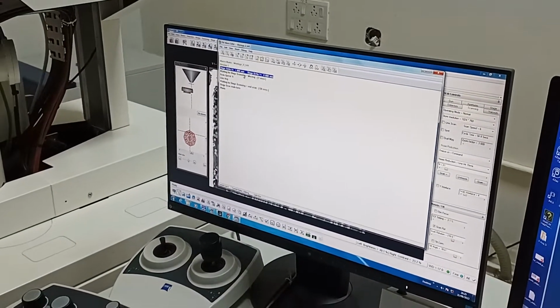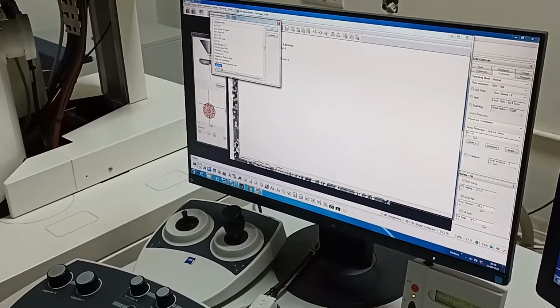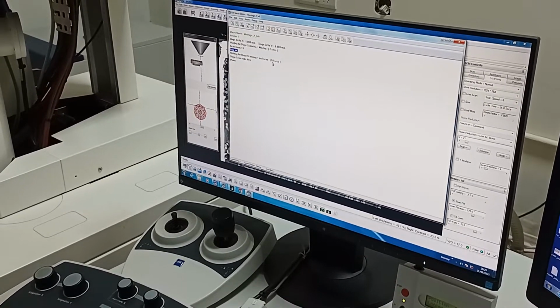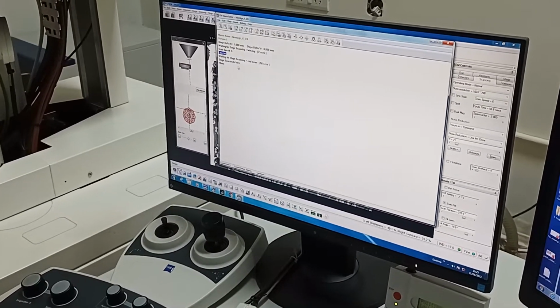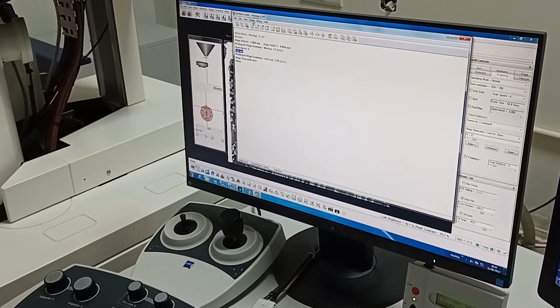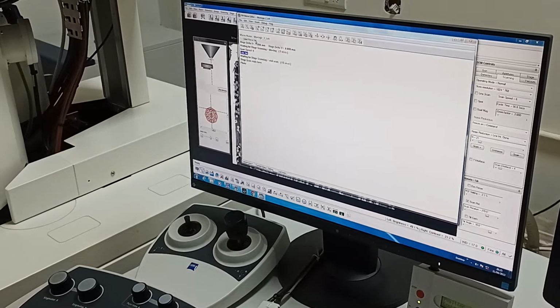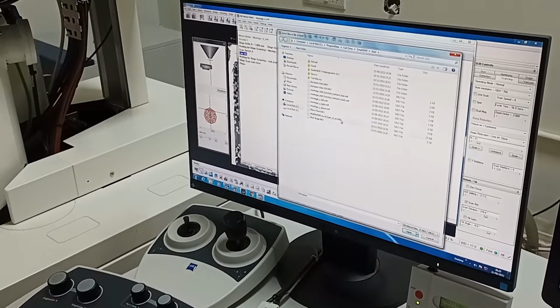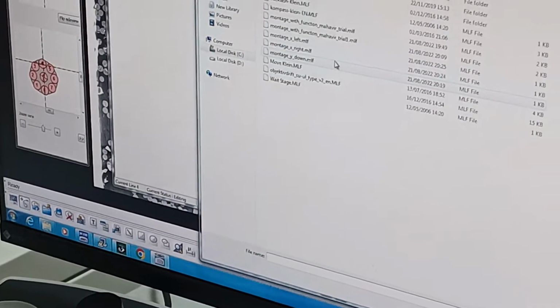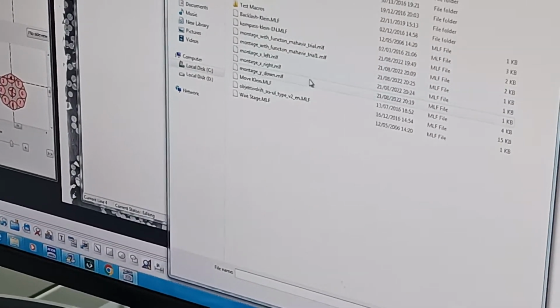Then save it. Line integral, and 58 seconds, right? Already set. Now save the method, and once again go to load and check. So you have here left, right, down. These only we have edited. So all things are set now.